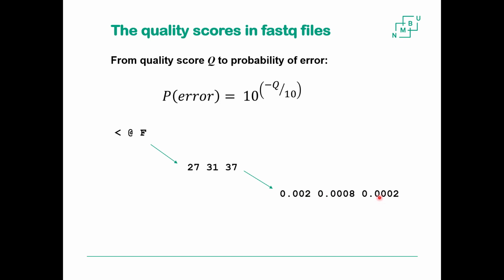And notice the reason we have this coding is of course that we want this quality line to have exactly 1 symbol for each base in the read, right? For each DNA symbol, we have a quality symbol. If we used these numbers here, it would be a horrible mess, right? The quality line would contain a lot of numbers and zeros. I mean, we couldn't see where one number starts and the other ends, right? So that's the practical reason for this coding.